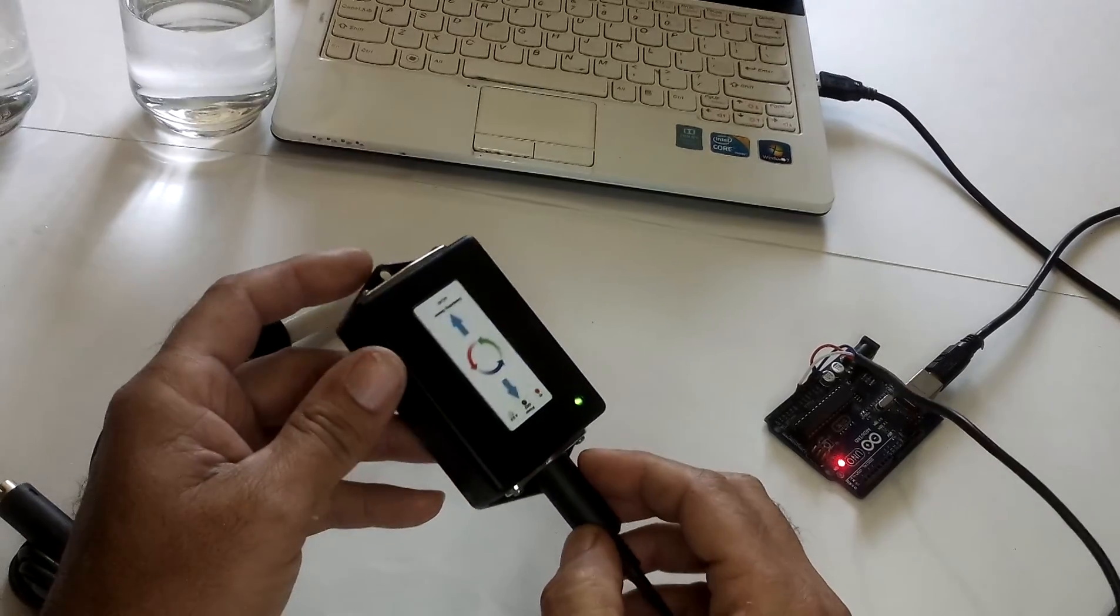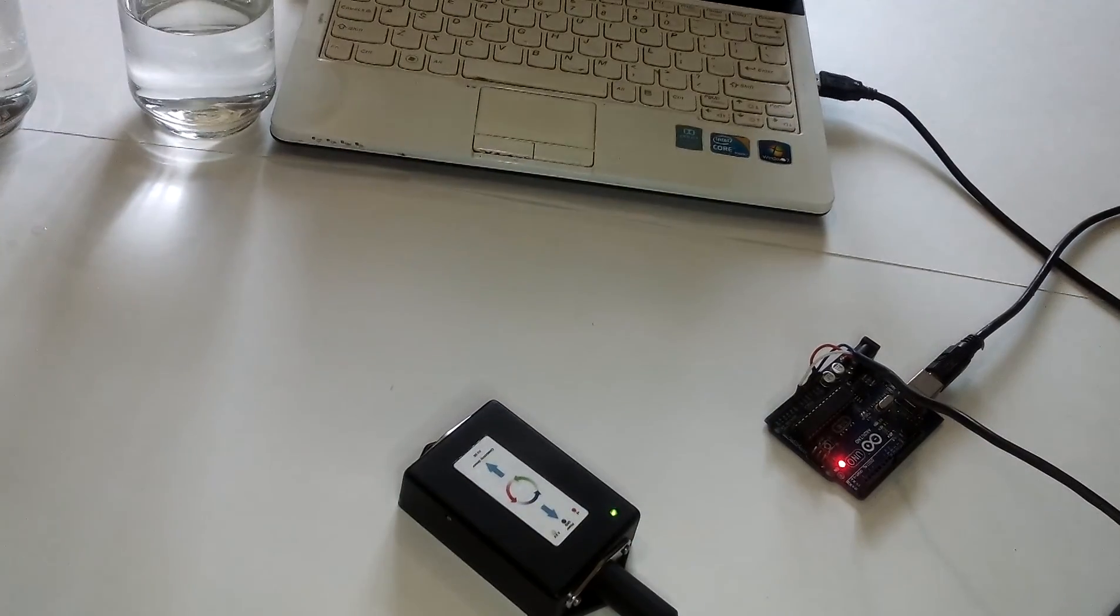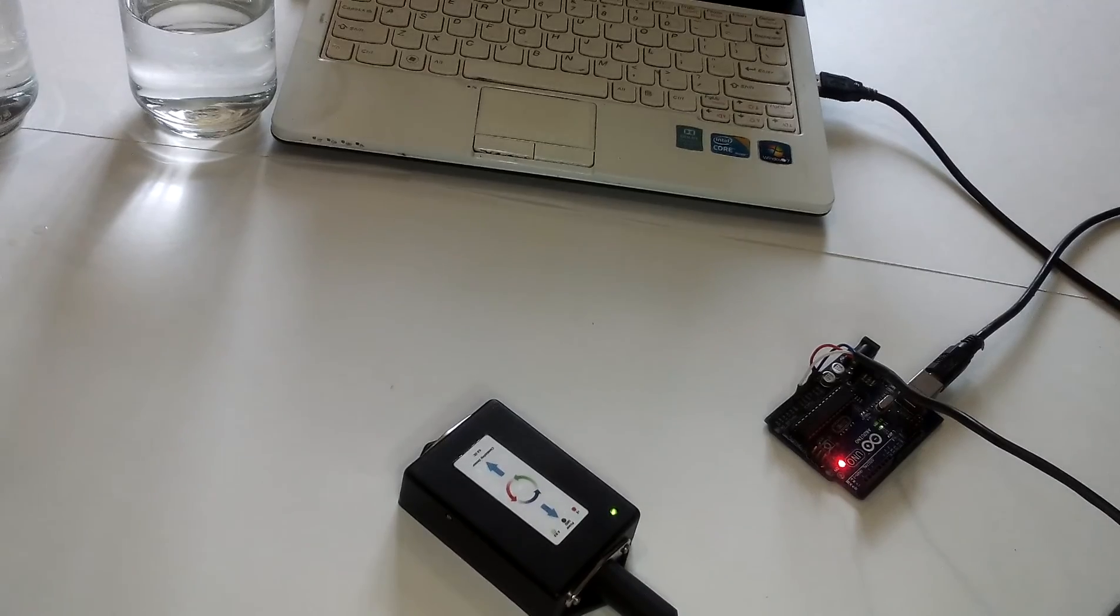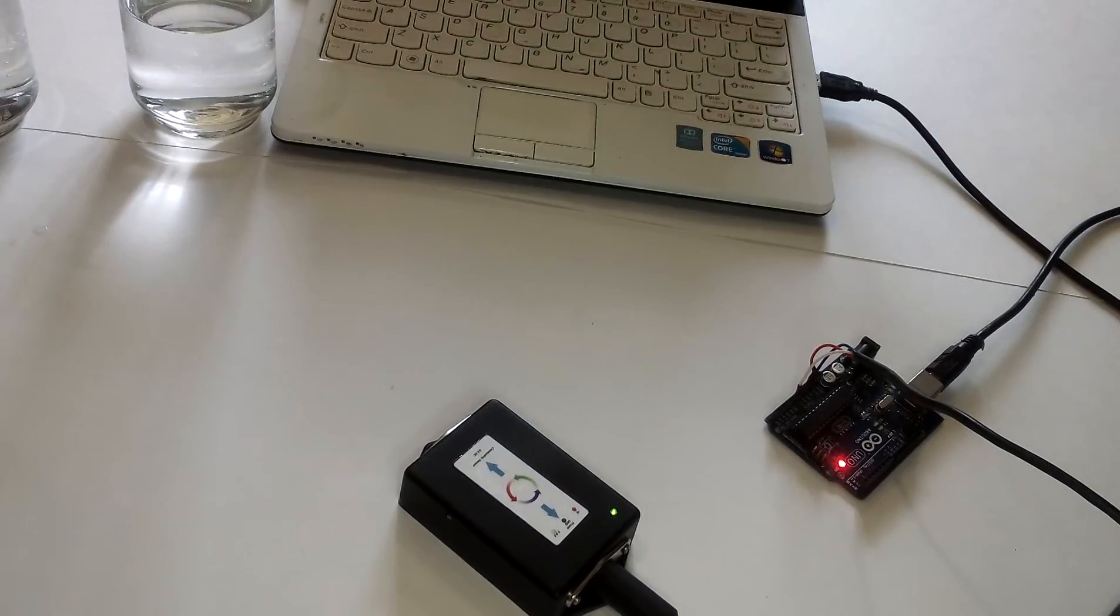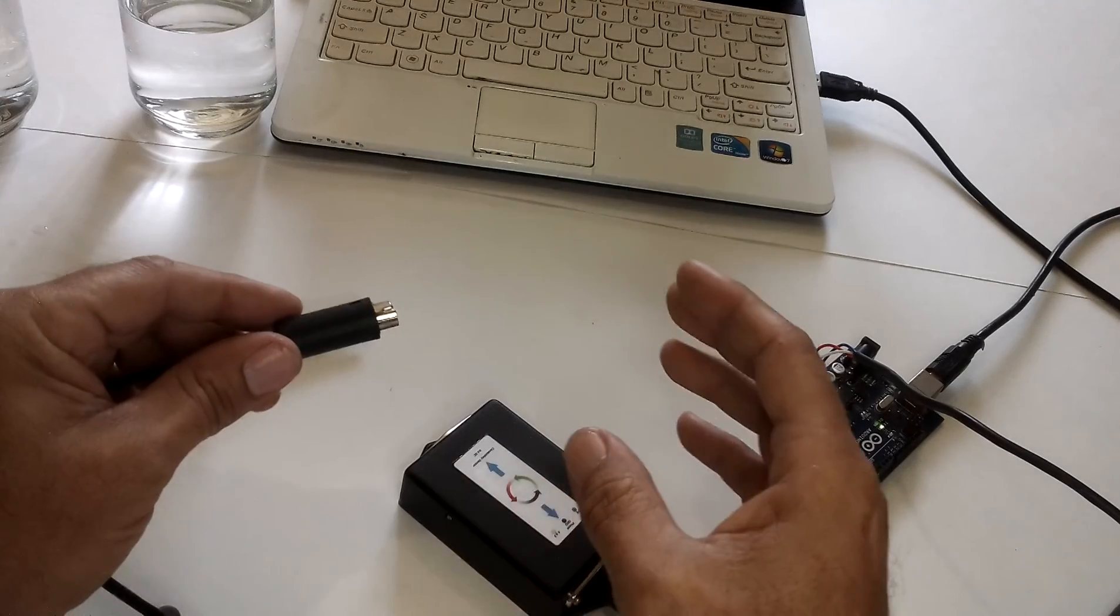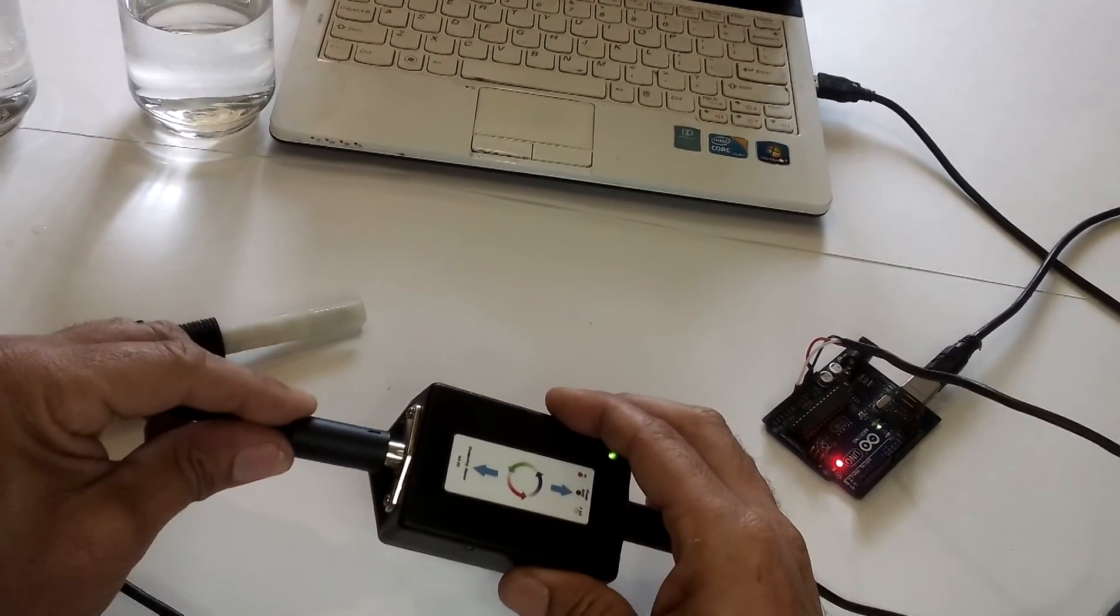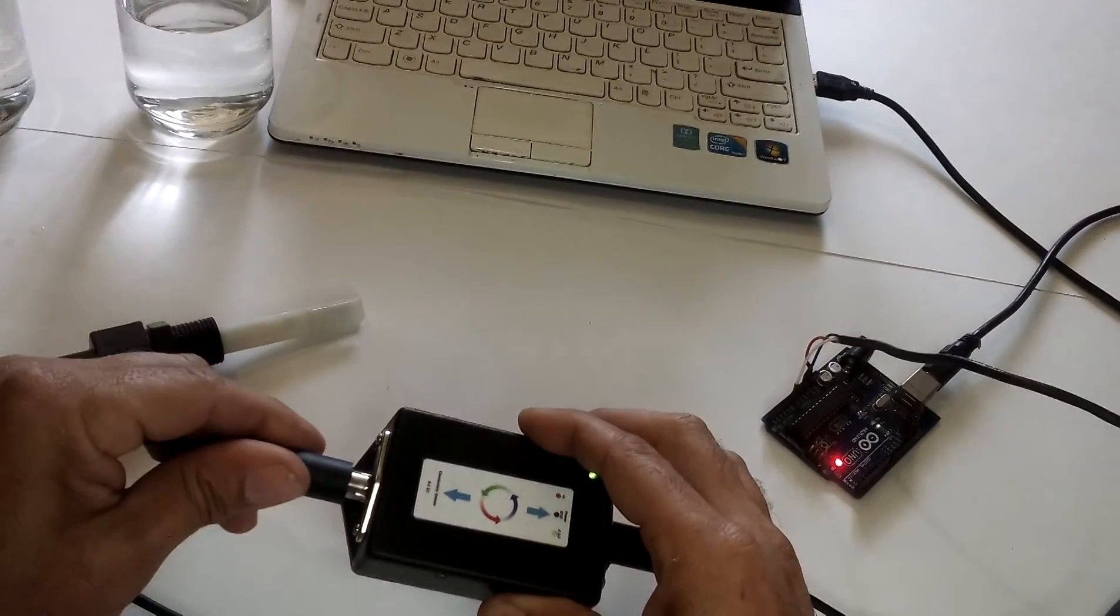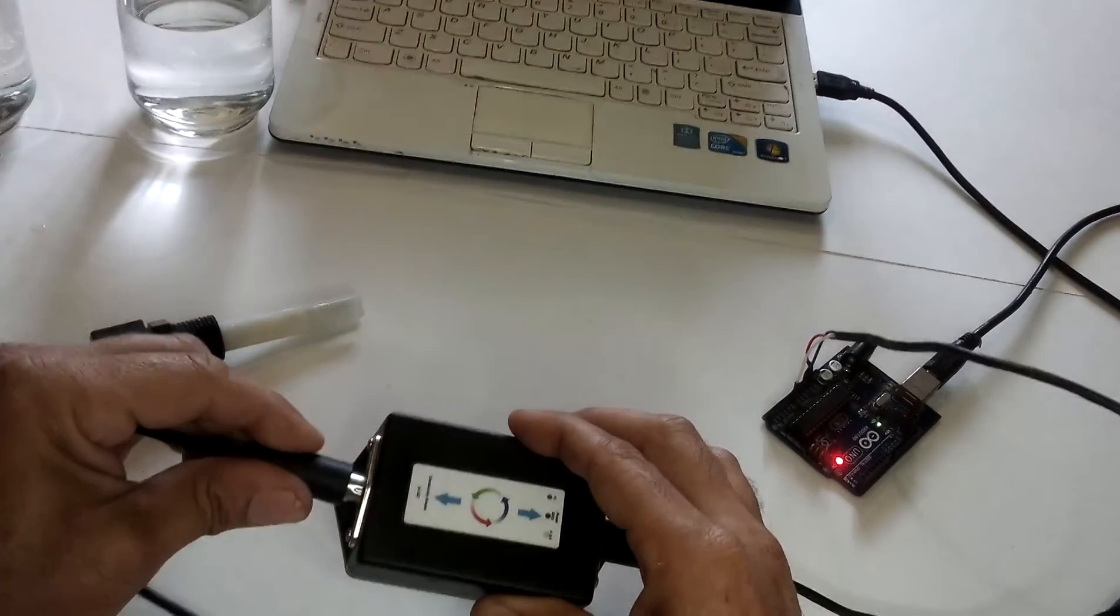You can see and now the probe itself. It does come with one meter of cable and also a ding connector. And let's connect this to the unit.